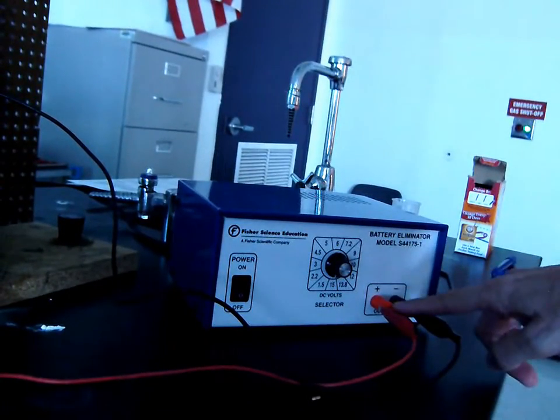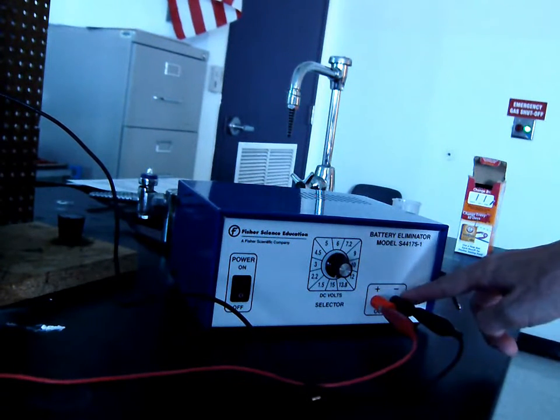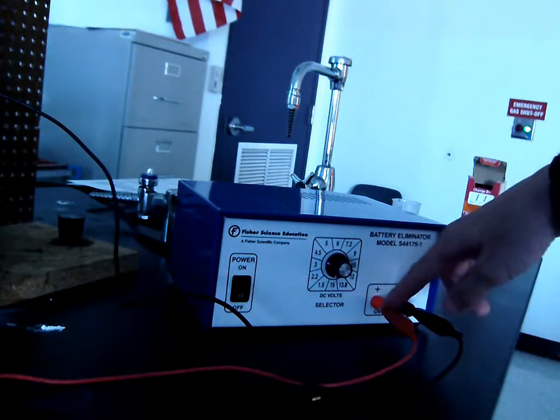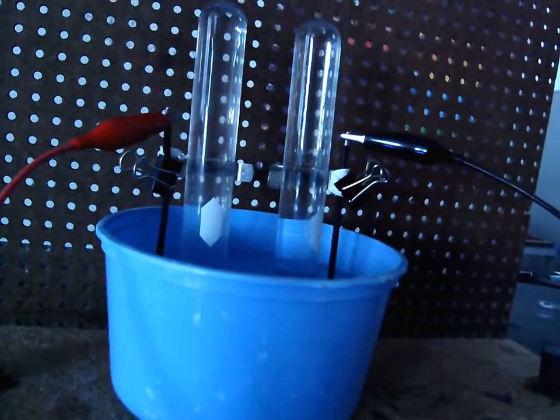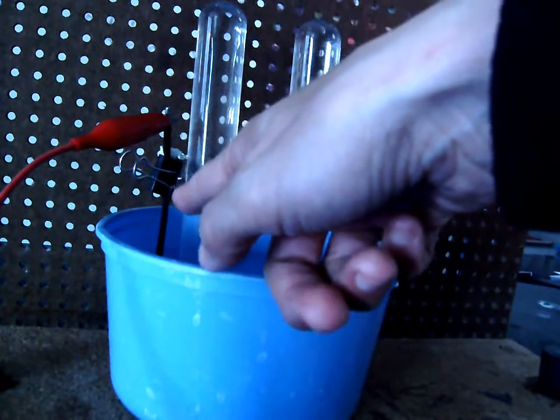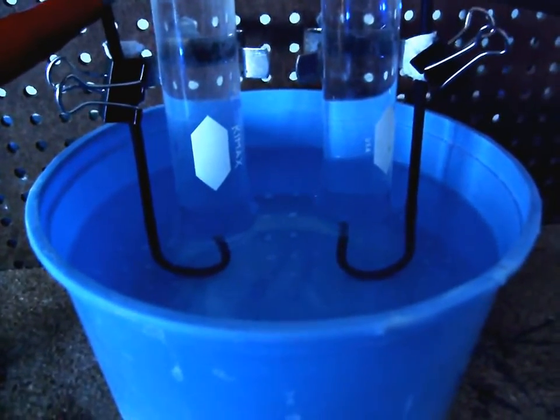So we have the red cord is running a positive charge, and the black cord is running a negative charge. So what happens is, from the battery, when I turn it on in a minute, the positive charge will run through the red cord, the negative through the black cord, over here to the electrodes that they're attached to. So the red cord, which has the positive charge will run through the electrode and to the very end of the electrode that's exposed in the water. I don't know if you can see that very well. It's kind of dark. I'm trying to adjust it there. That might be a little bit better.